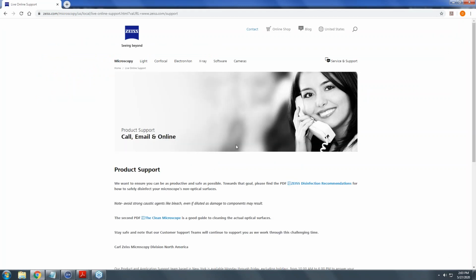So hi, everybody. We just wanted to make you aware of this online support page, which has some valuable information. You'll see here that we have a disinfection recommendation. It's a one-page document. We also have a more complete cleaning your microscope and disinfecting your microscope document here in our handouts if anybody wants to download it. If you have any issues, just let us know and we'll gladly send it to you.